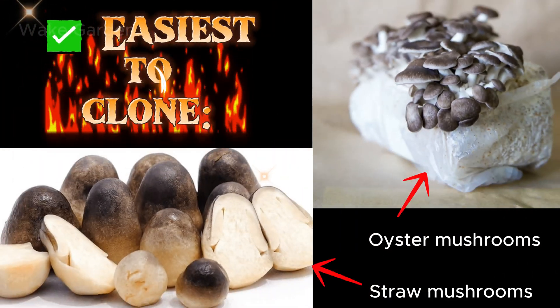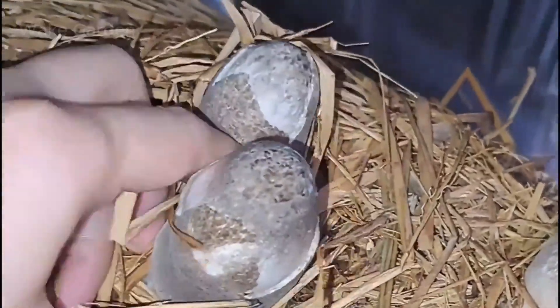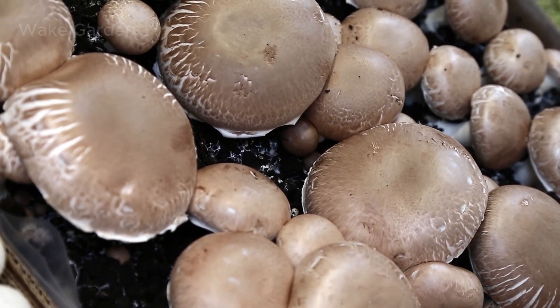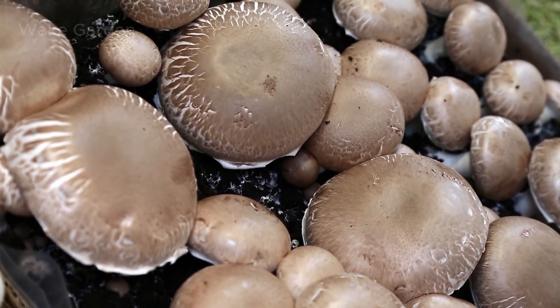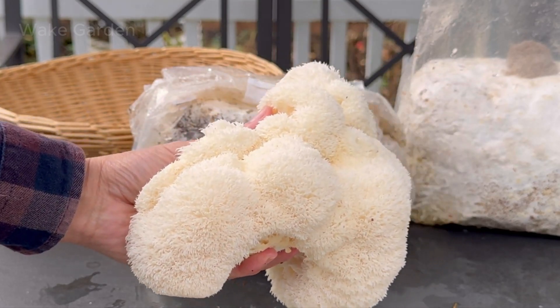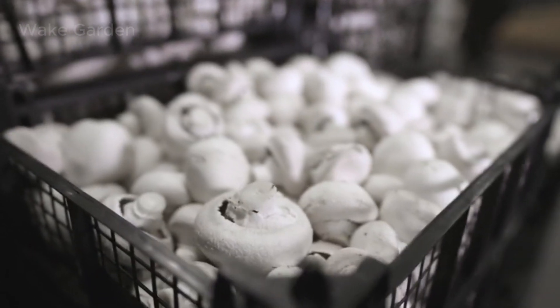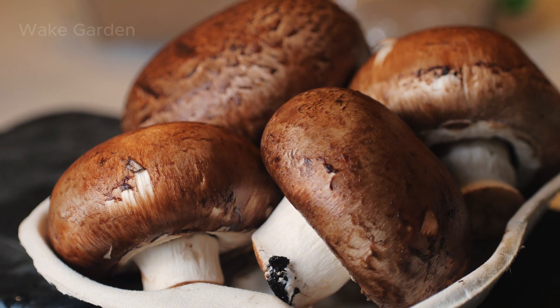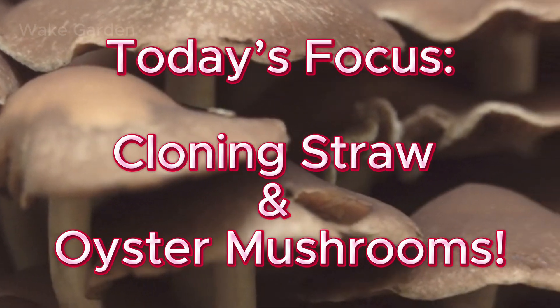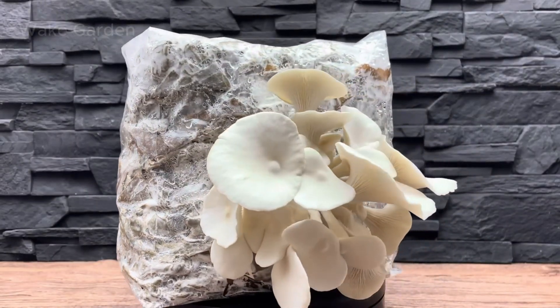Not all mushrooms are equally easy to clone. Some, like oyster mushrooms and straw mushrooms, grow fast and are very forgiving. Others, like shiitake and lion's mane, take more time and require stricter conditions to succeed. And then there are mushrooms like button mushrooms and portobello, which are much harder to clone using simple home methods. Today, we'll guide you through the easiest method for two beginner-friendly mushrooms: straw mushrooms and oyster mushrooms.